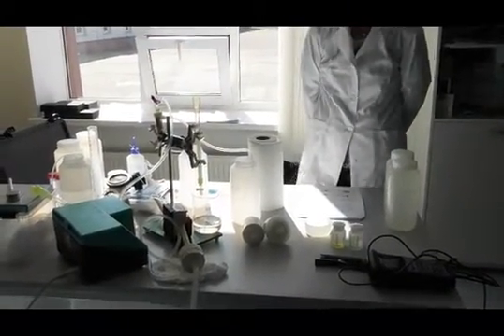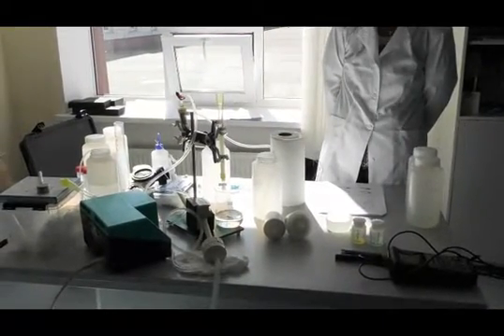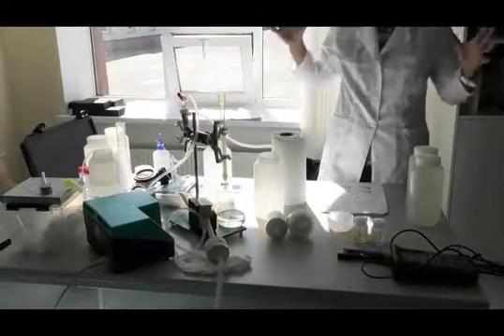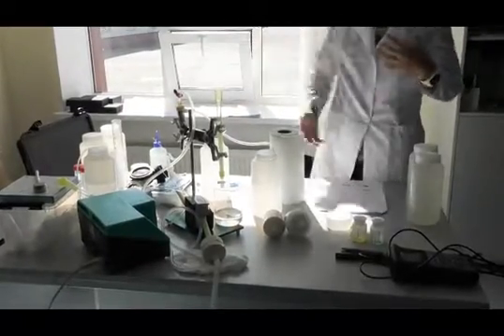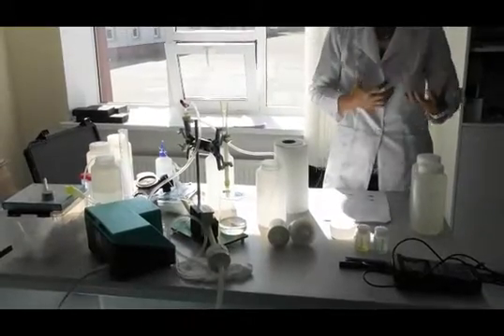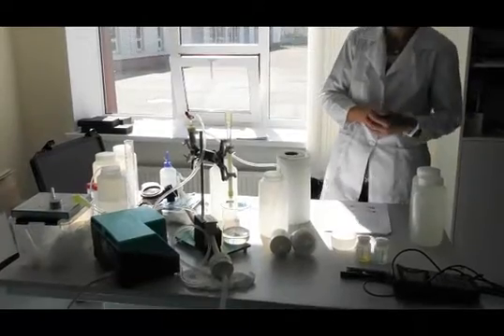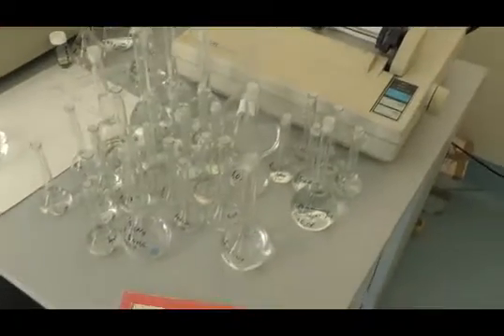It's not that convenient to do that because we need to bring the pumps for the bigger filters. We need bigger pumps because we need a certain flow through the filter to avoid this clogging, and we need electric power.